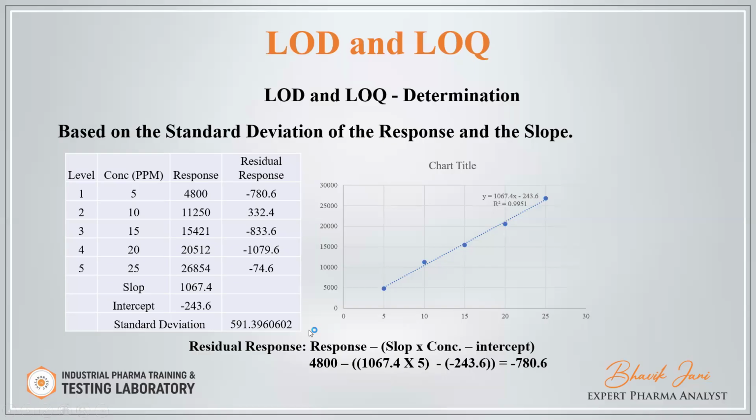So by that we have calculated the residual response for all the concentrations and calculate the standard deviation. The standard deviation is 591.3960.